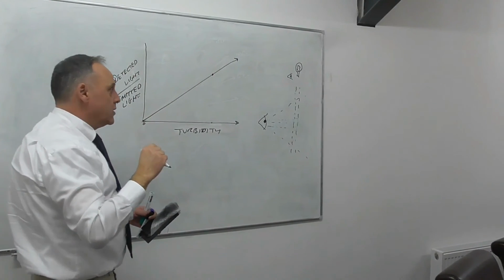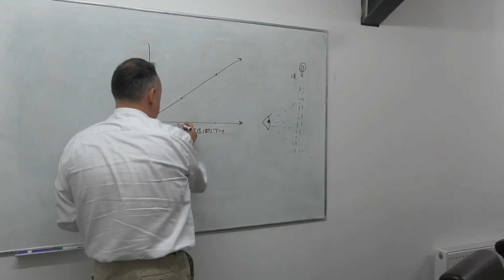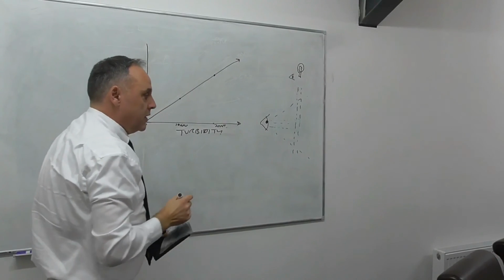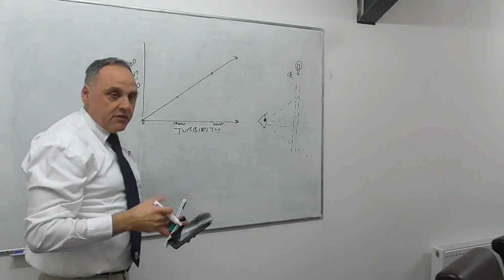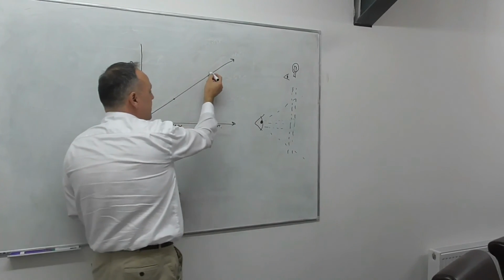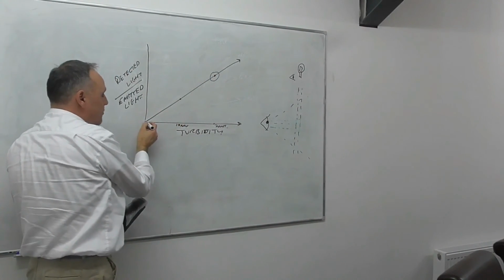If I now halve the amount of light, that gives me 10 NTU. Physics. I've got 2 points on my graph, and I can do a regression through to 0 without ever needing to set a factory 0 and without ever needing to put a 0 sample in it. So from a single sample, utilising this clever physics, I can do my perfect calibration through 0.